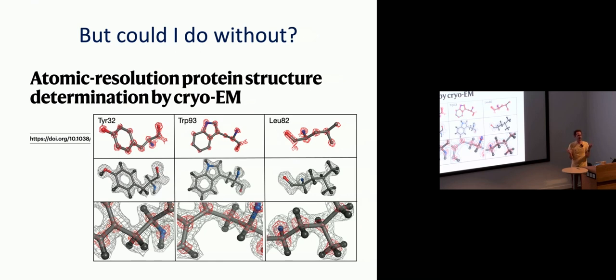But my question would be, why would you do that if you can just do it in the computer too? So I think doing this in image processing, provided you can estimate these things reliably, is the way to go. There might be cases where that's difficult, and then there would be an argument for a microscope like this. Otherwise, I would say just keep things simple experimentally and solve some of the things in the computer. But of course, this is a philosophical discussion best had over beer, perhaps.